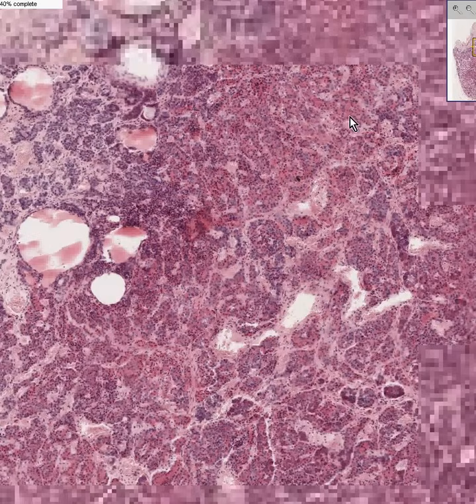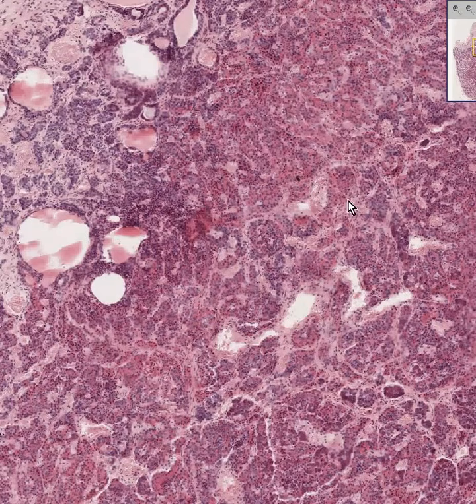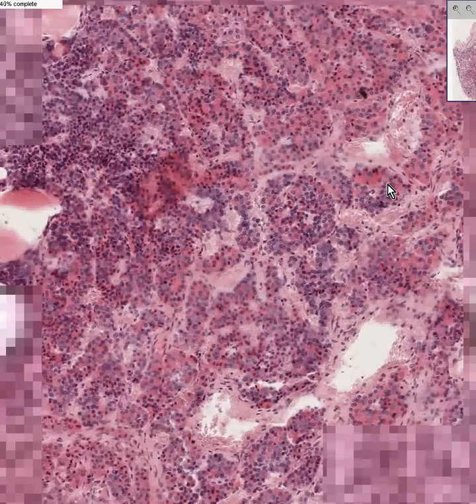The anterior lobe of the pituitary has three different kinds of cells. The cells that you could see here that look really, really red are acidophils. The cells that you see here, which look considerably bluer, are basophils. The cells that you could see here and here and here, sometimes individually, which have no color uptake, they hate color, that's why they're called chromophobes. The hormones of the anterior pituitary come chiefly, if not entirely, from simply the basophils and the acidophils.